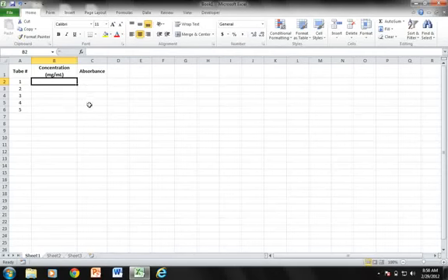in the spectrophotometer. We're going to use that information to make a standard curve with a graph and a line of best fit, and then from that standard curve we're going to be able to calculate the concentration of an unknown sample if we can at least obtain the absorbance of that unknown sample. So again, all I've done is list my tubes 1 through 5 for my serial dilutions. That will be my concentrations in milligrams per milliliter and my absorbances.